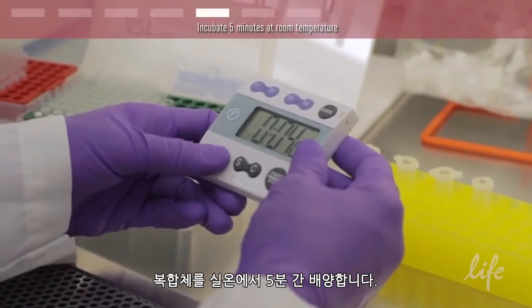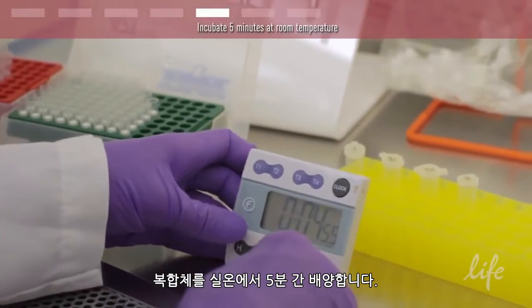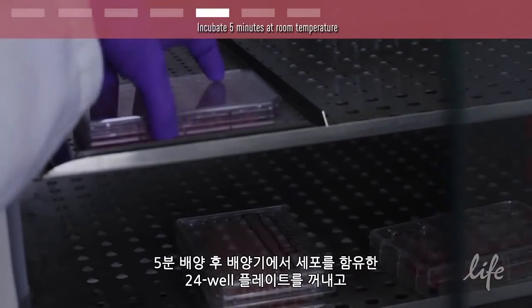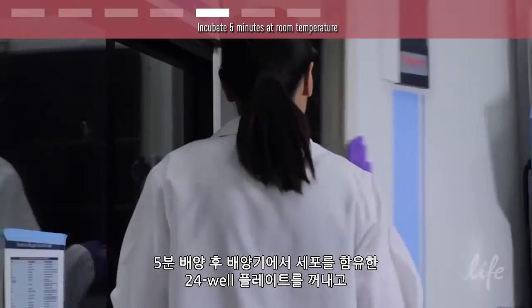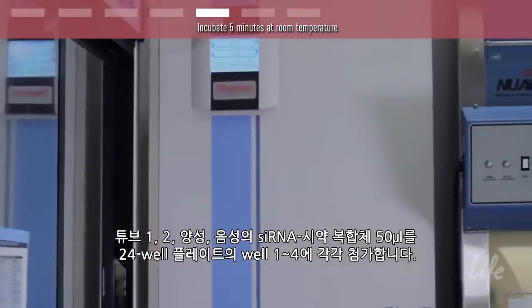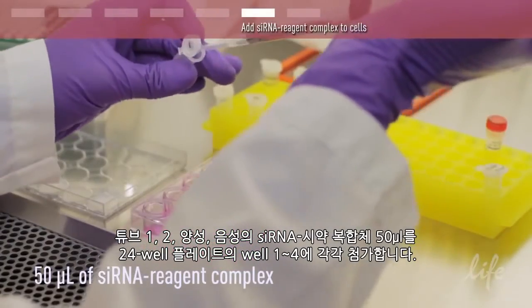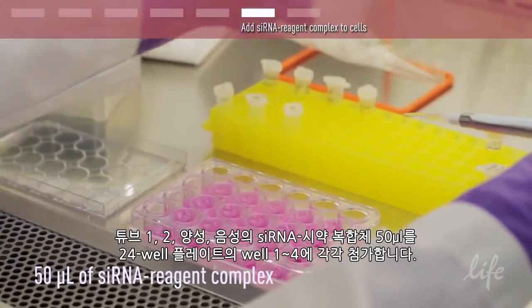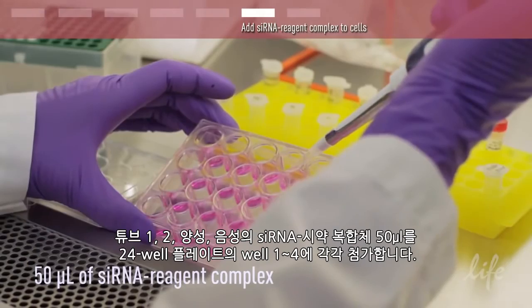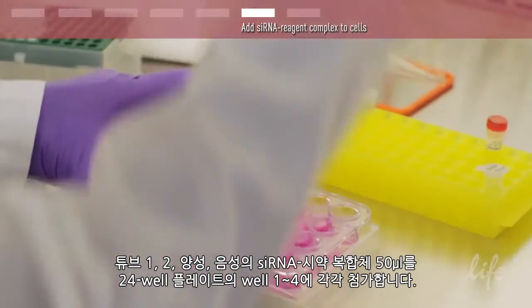Incubate the complexes for 5 minutes at room temperature. After the 5-minute incubation, remove your 24 well plate containing your cells from the incubator and bring it to the workspace in the hood. Add 50 microliters of the siRNA reagent complex from tubes 1, 2, positive, and negative to wells 1 to 4 of the 24 well plate respectively.